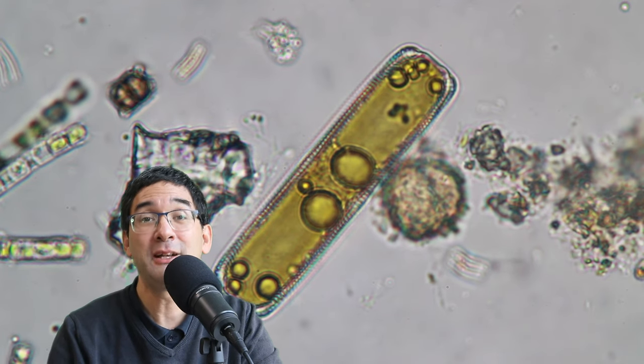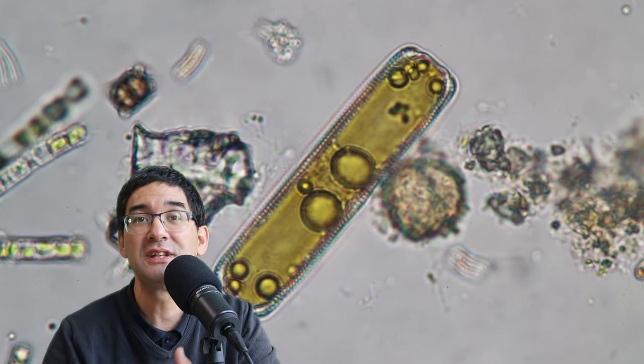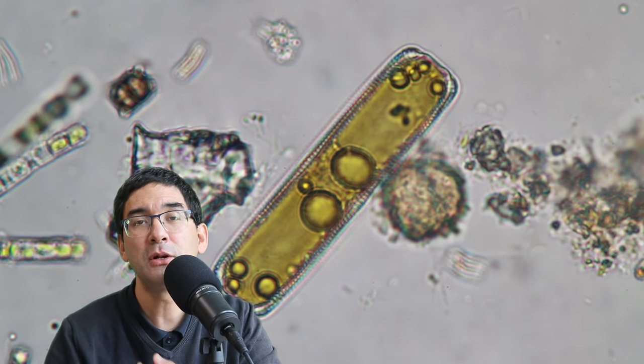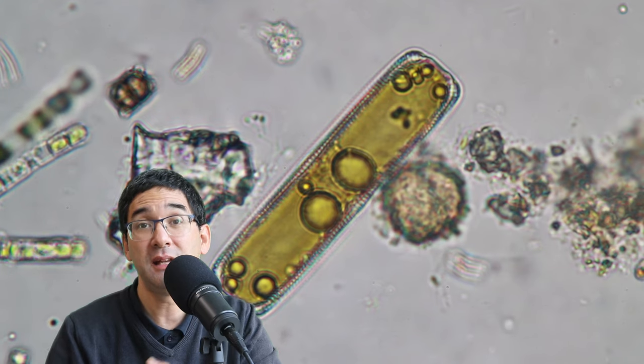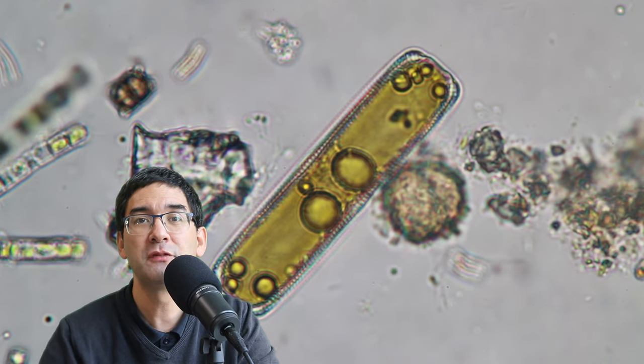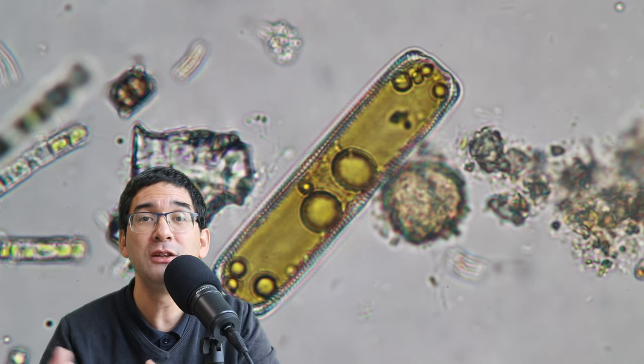This here is now a live diatom. And you know it's alive because it has a color because the green color here, that is because of the chloroplast, which is doing photosynthesis. And yeah, after all, diatoms are responsible for producing a lot of oxygen in the earth's atmosphere.